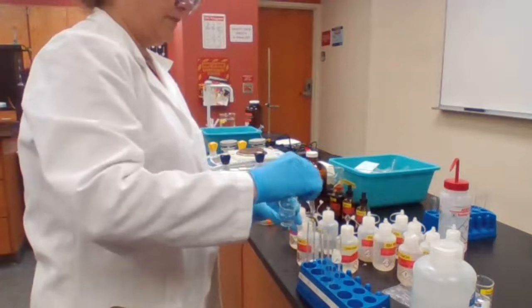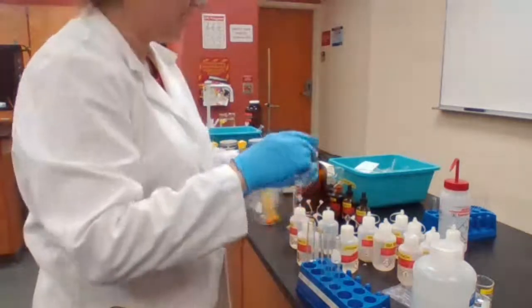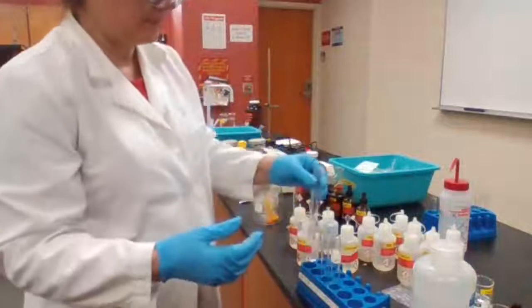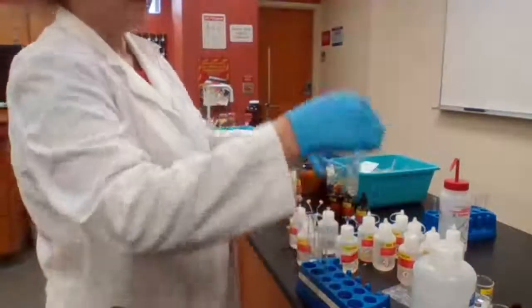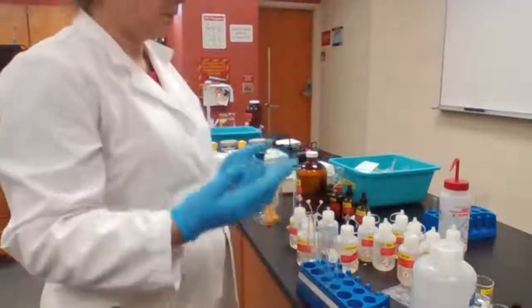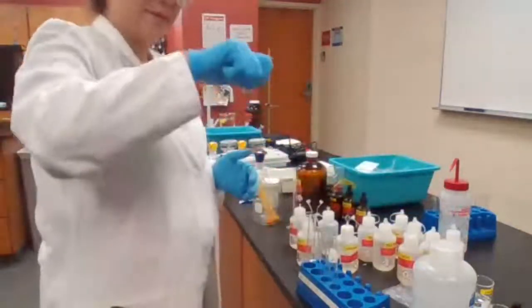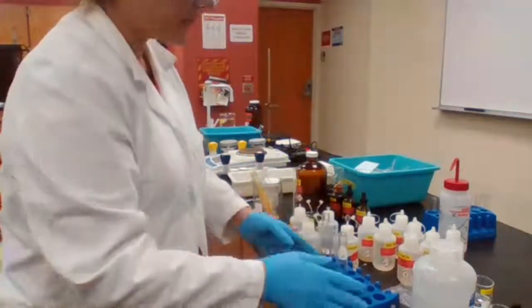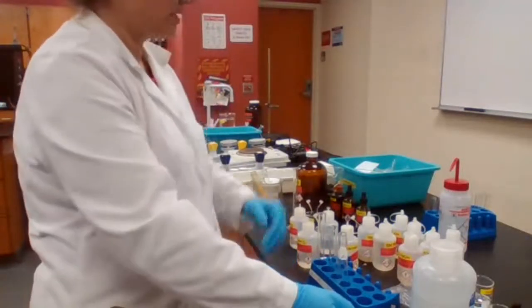Okay. Each time, 1 full dropper is approximately 1 milliliter. For qualitative analysis, it's okay. When it's quantitative, like when you are doing a titration or a sensitive measurement, we have to use accurate measurement. But every 20 drops counts as 1 milliliter or 1 full dropper. With this dropper that I'm using, each time I squeeze it fully, it takes approximately 1 milliliter. And next, we are adding 10 drops of sodium hydroxide to each.